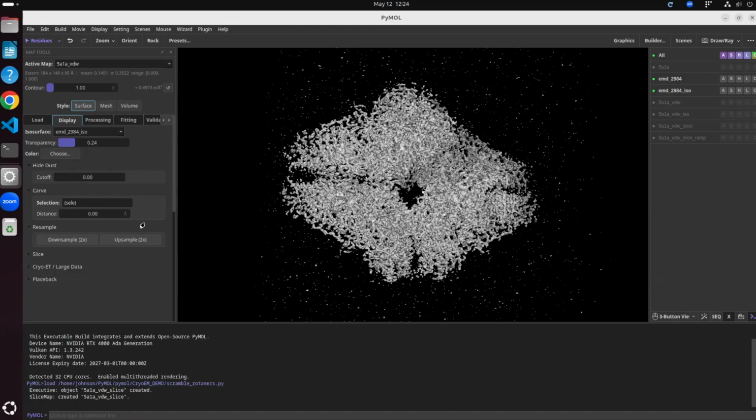Okay, thank you. Historically, PyMOL had done some things where they would do infinite density with crystallographic maps. And it sounds like, well, you don't have crystallographic symmetry for cryoEM or cryoET. So thank you. Yep.